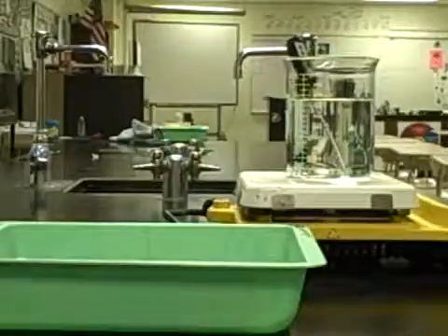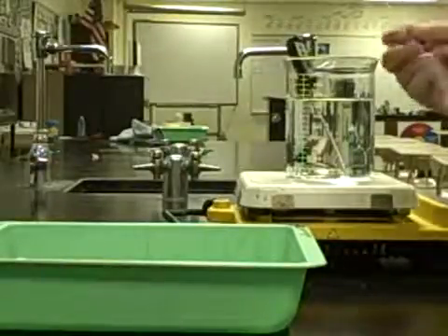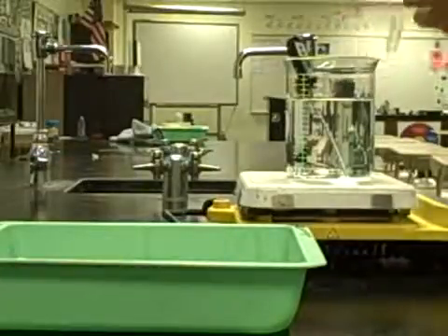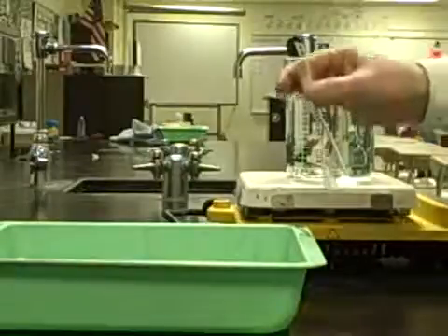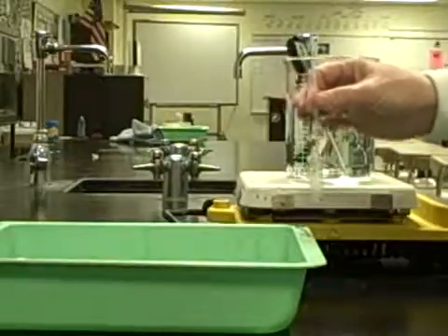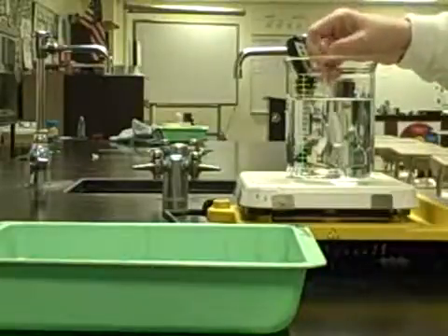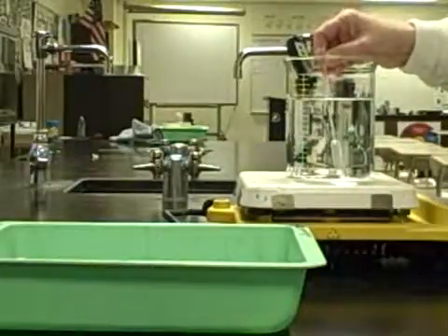Then, checking to see if gas expands in hot water. Step 5 on the next page says holding the empty pipette, and by empty I mean just air in it, don't have any water in here. Hold the empty pipette by its stem. Immerse the bulb in 35-degree water. The stem should be up and it should be open. So I'm going to stick it in here. I'm going to immerse the pipette as far as I can.